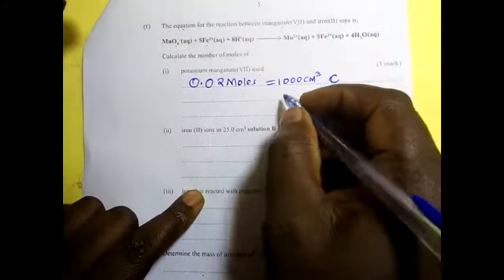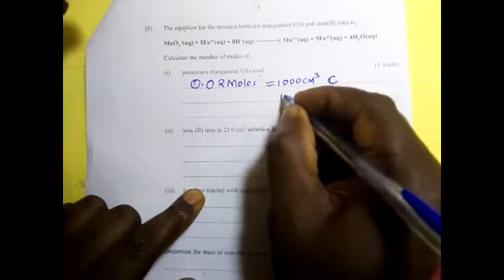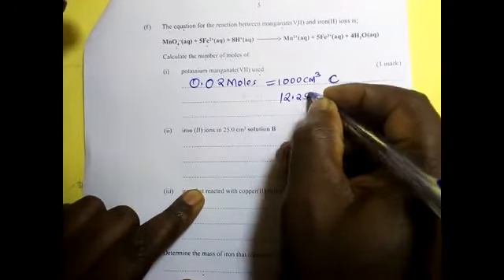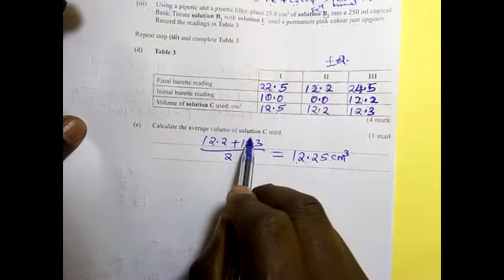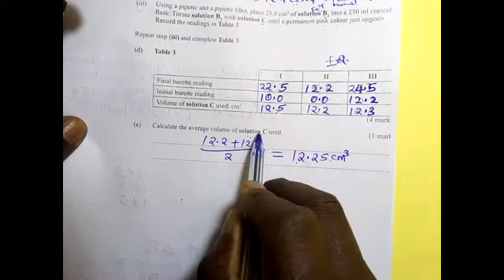So we have used 12.25, this volume here. We have used 12.25 of solution C, acidified potassium permanganate.